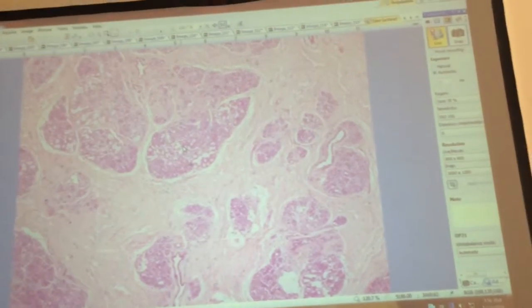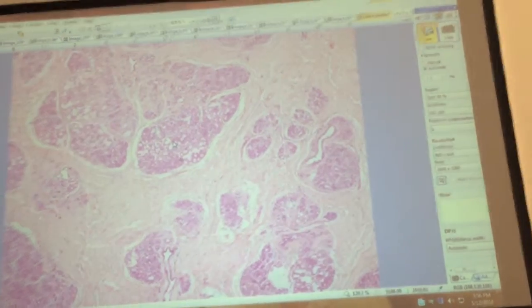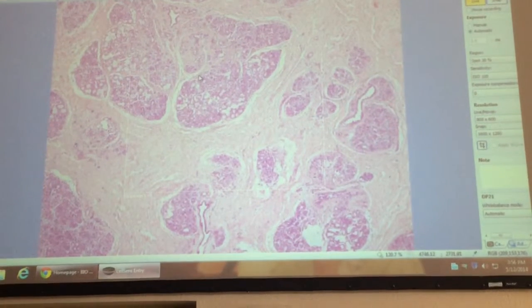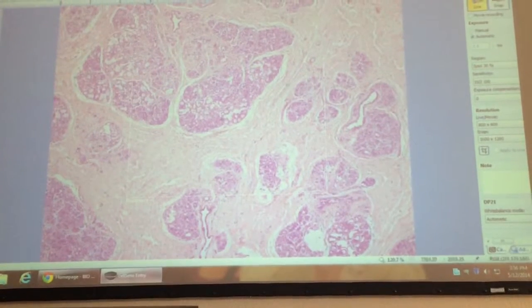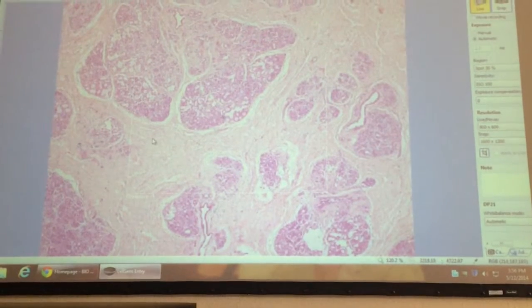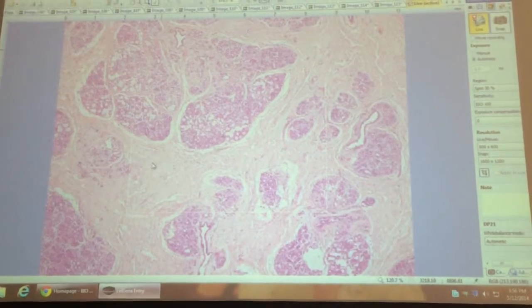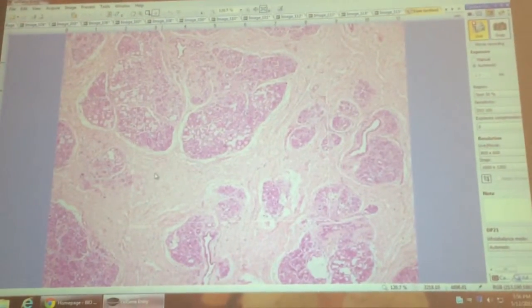The only reason I said it was when I magnified it, it looked like adipose tissue. There could be adipose tissue kind of like sandwiched in between, but it wouldn't be in the actual gland itself. And most likely what you'd see, and I'm just not seeing it in this slide, you usually see like little pockets of adipose, but they're very small pockets, and then usually be sitting like out in here. So you get like a little pocket of adipose or a little pocket of adipose, usually out in here. Okay, but I'm just not seeing it in this slide. Yeah, I didn't see it in that one. Yeah, it could just be that the space gets taken up by the glands instead of the adipose. The adipose is taken away during that time.